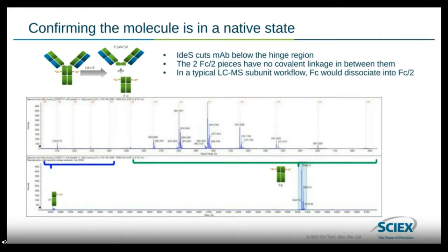With the IdeS cut, we can see the majority of the molecule has been cut, as we see primarily the Fc region, which is good, and we see minimal dissociation into Fc/2, as you can see in the bottom part.